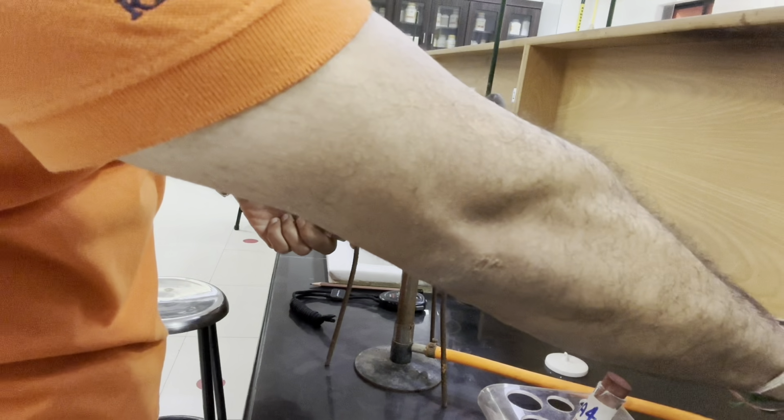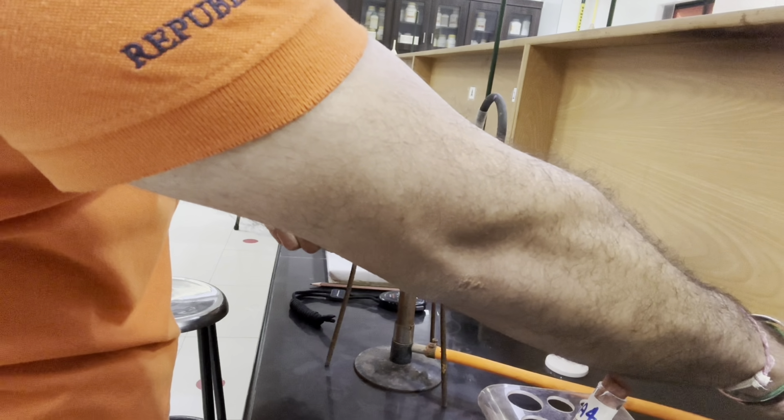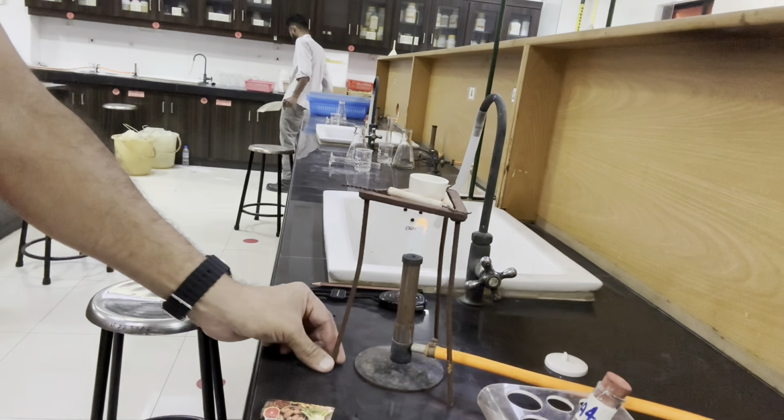As soon as we start heating, we will start the timer. Now, heat gently means you have to keep the flame as low as it only touches the bottom of the crucible.